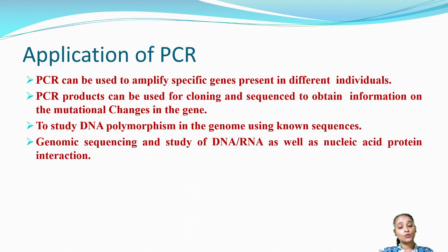For genomic sequencing, and the study of DNA, RNA as well as nucleic acid-protein interaction, you can use PCR. And also for analysis of AFLP, that is amplified fragment length polymorphism, you are using this PCR. So these are the different applications of PCR.